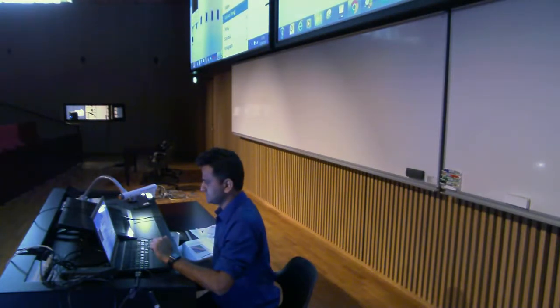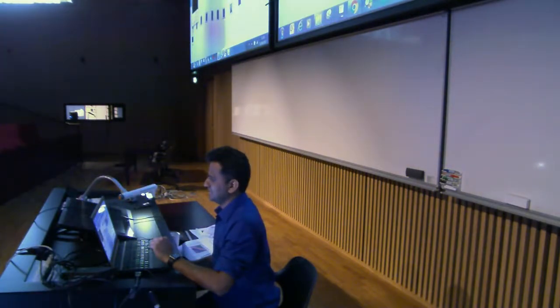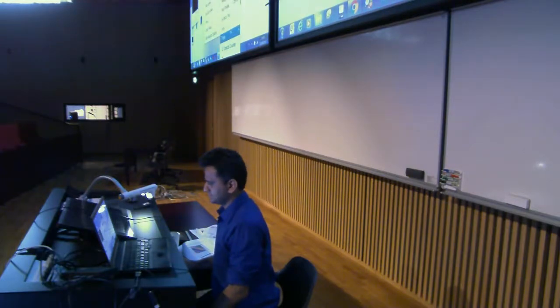Volume viewer, did we see this volume viewer? Yeah, we saw it, right? Yeah, I would prefer the MRS one over this, so I'll just close it. What else? Tools. Unless there is a specific question, I don't know.